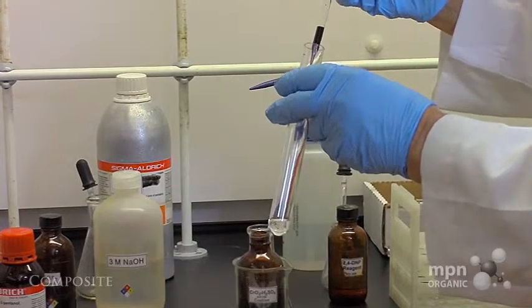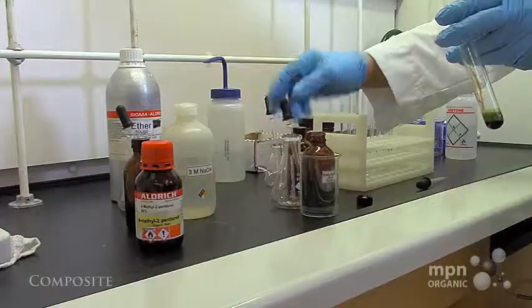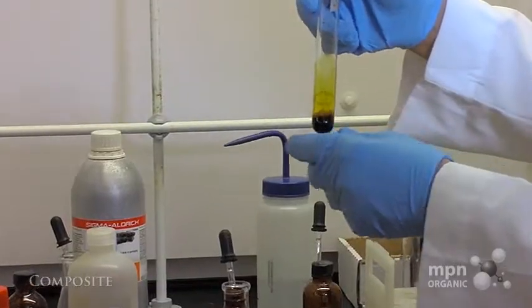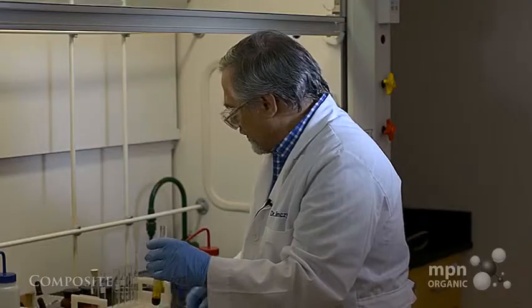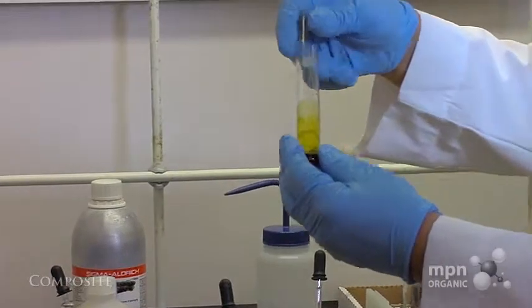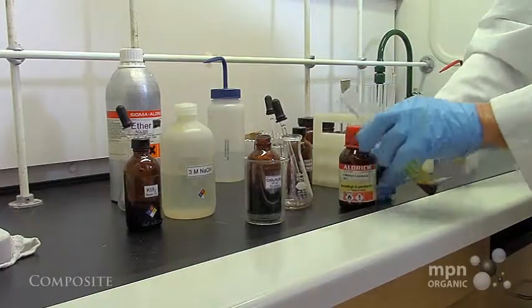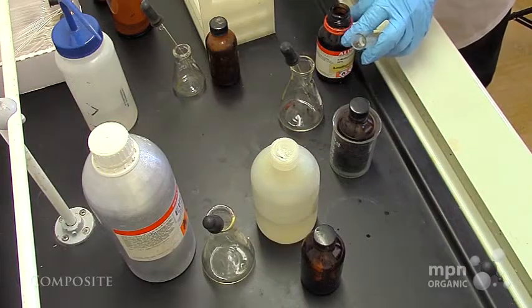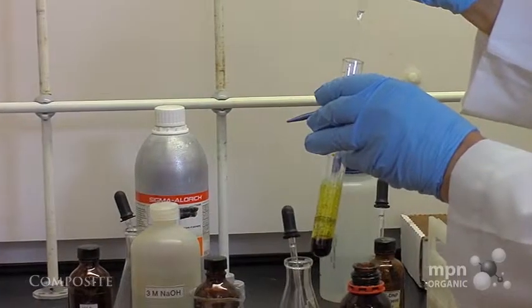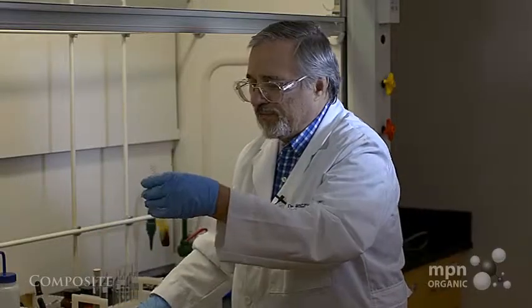But as soon as this hits the alcohol in acetone, it turns green. Now it gets a little hot here, so what I'm going to do is to see, we've added more than enough. You can see that we have much more chromic acid in there than we need. So let's just titrate back. We're going to add a little bit more 4-methyl-2-pentanol to discharge the color and get back to that green. So here we go. 1, 2, 3, 4, 5, 6, 7, 8, 9, 10. Let's say that that's enough.